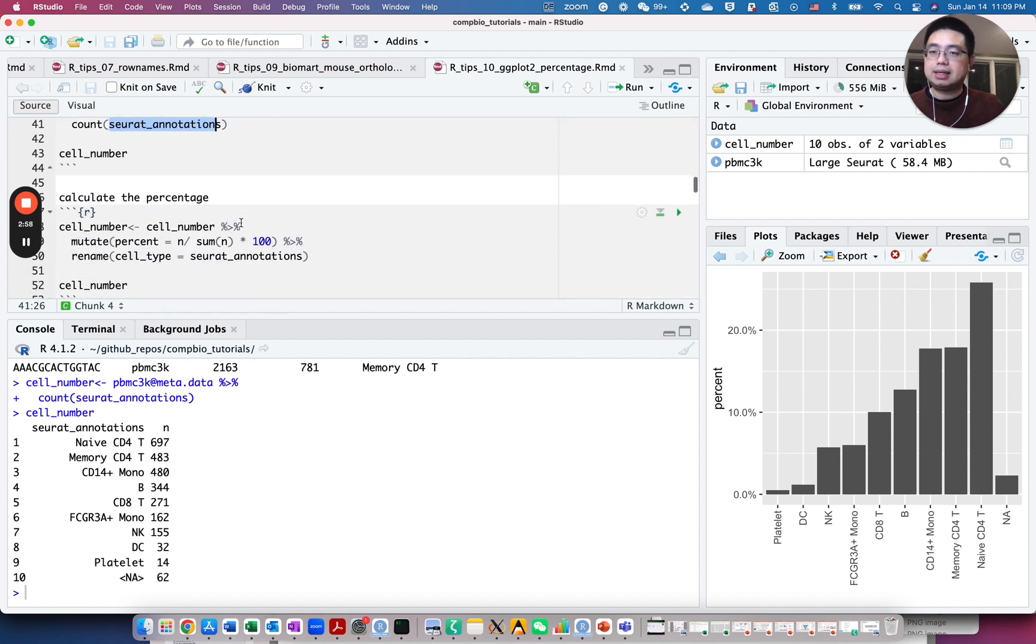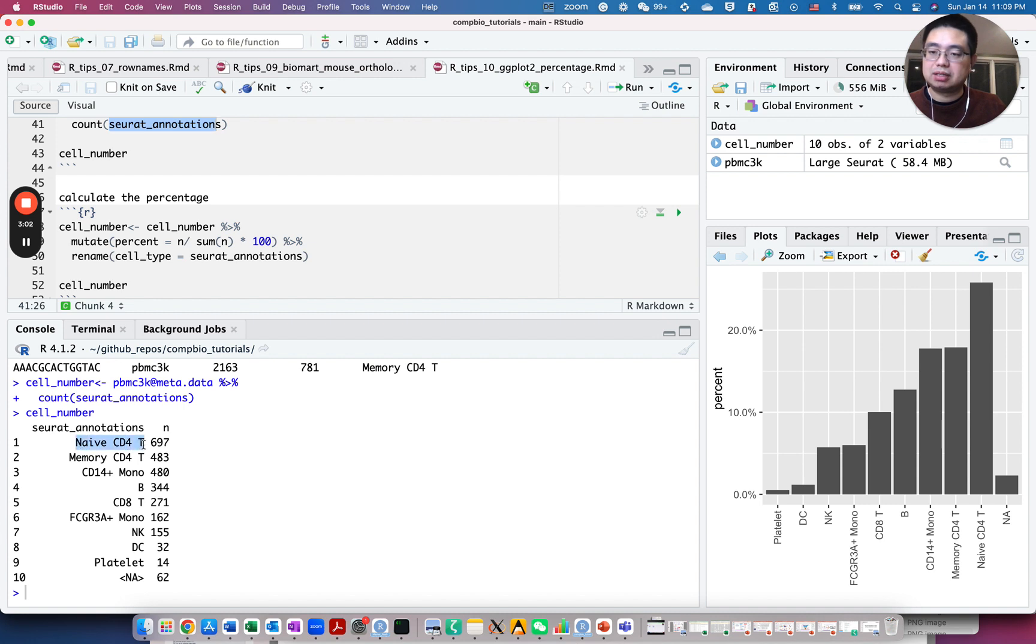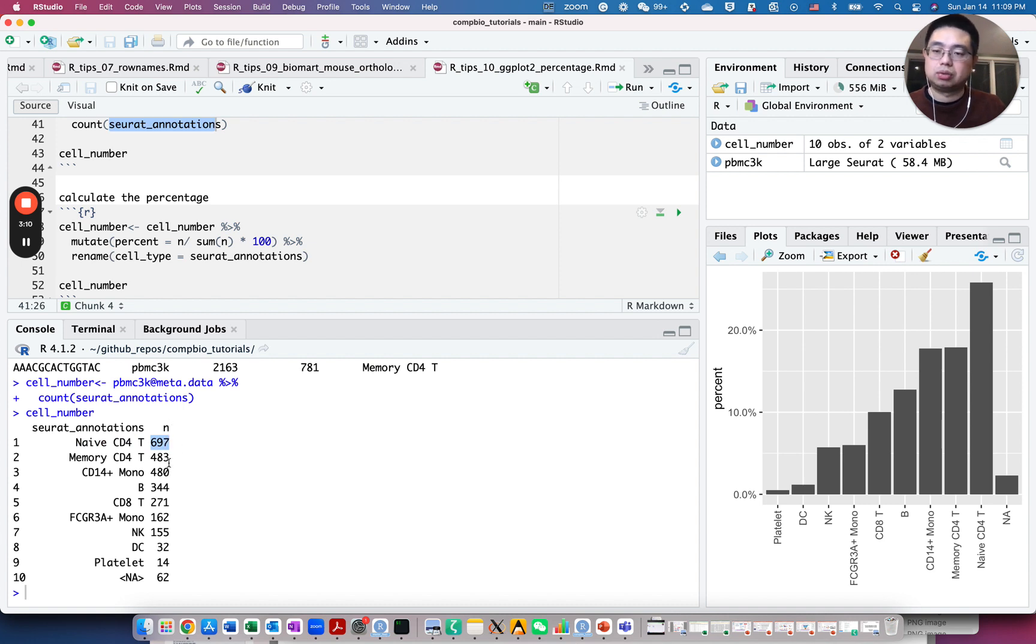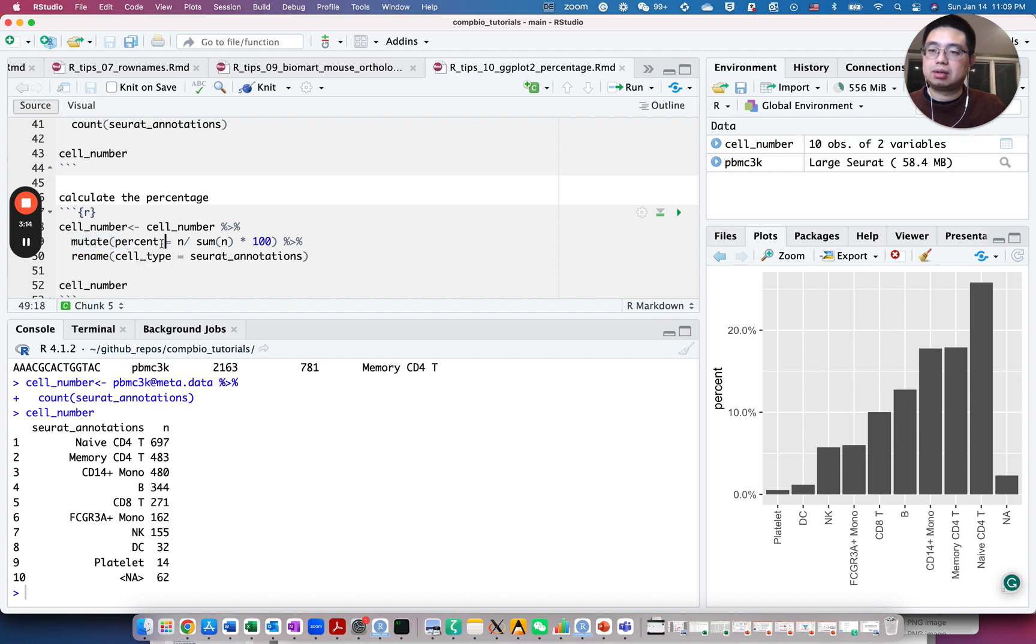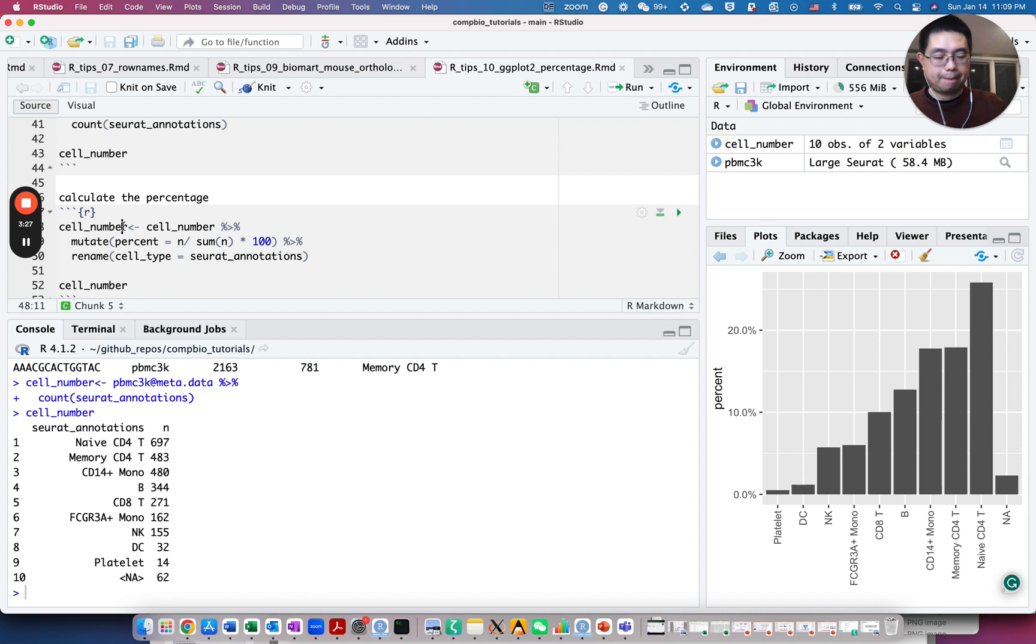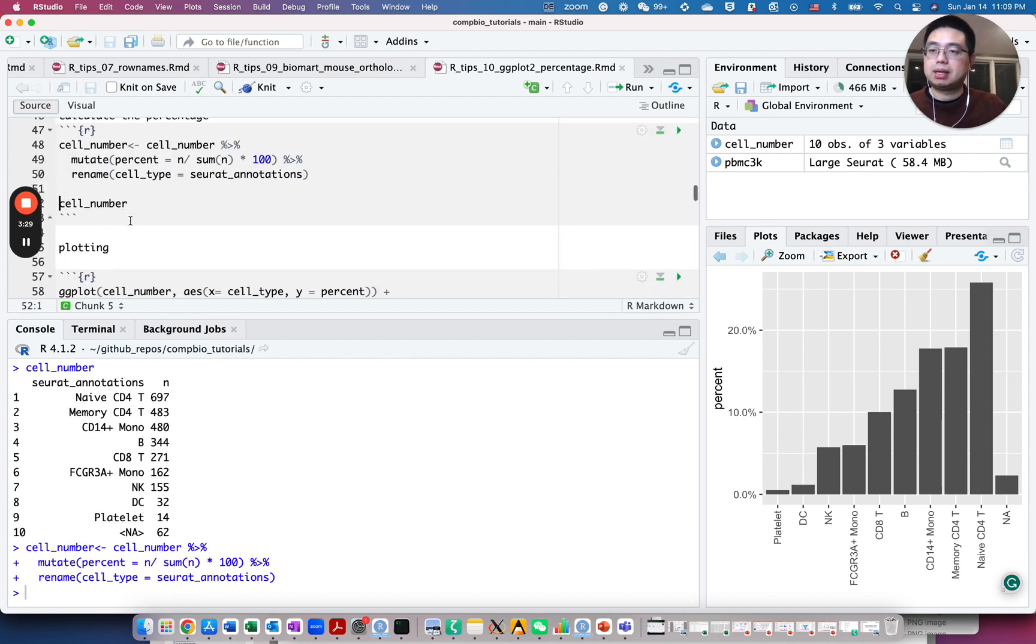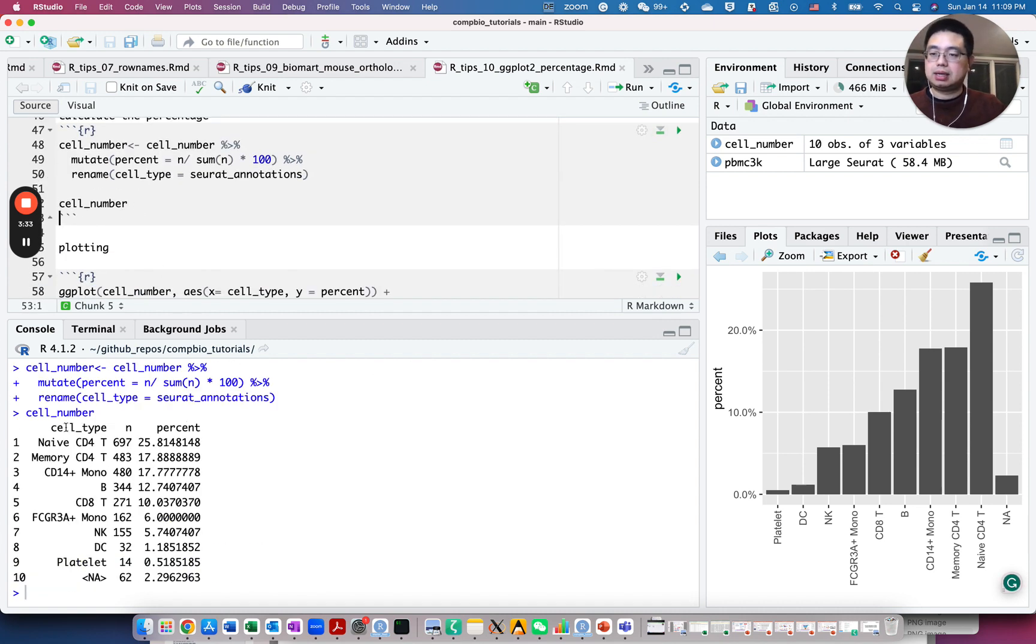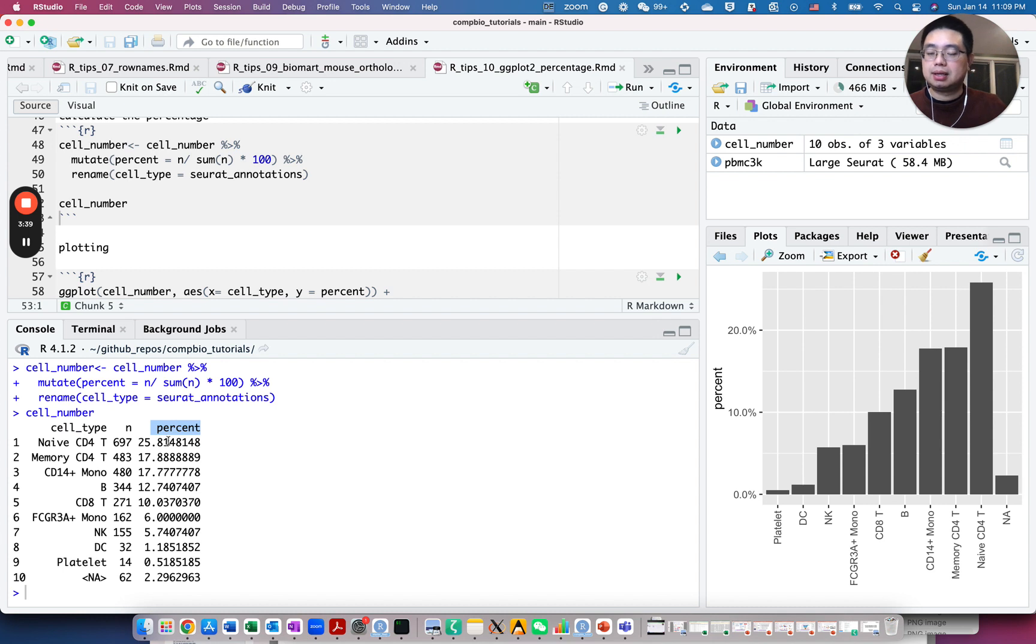Now with that, we can calculate the percentages. For example, how many naive CD4 T cells, what's the percentage? It has 697, but then we need to divide by the total number. So we can use the mutate function and calculate percent equals to n divided by the sum of n. Sum of n will be the total number of cells in that sample times 100. And we will also rename this column name as cell type. Let's look at how it looks like. So now cell type is renamed, and now we have a new column called percent with the percentage.